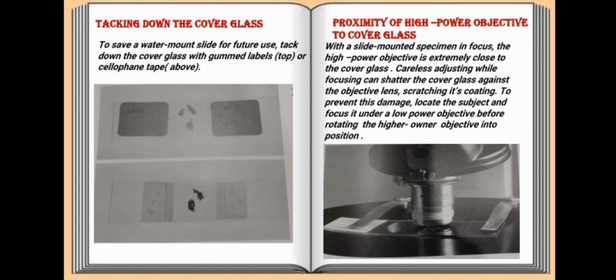Tacking down the cover glass is to save a water mount slide for future use. Tack down the cover glass with gummed label tops or cellophane tape above this one, as you can see in the picture.